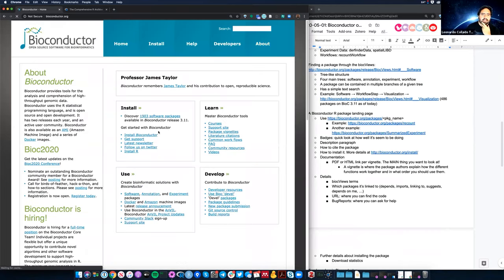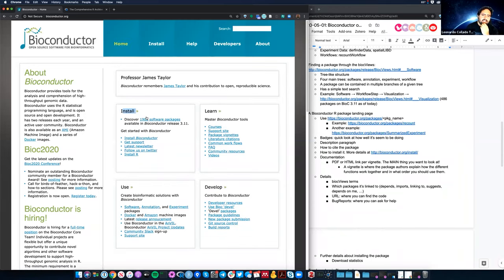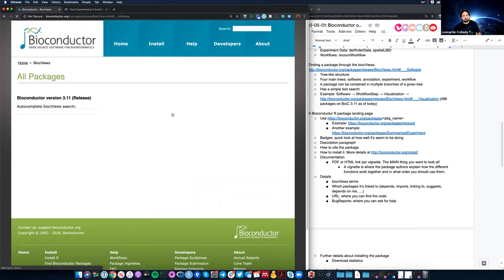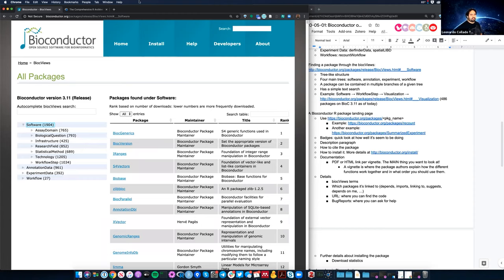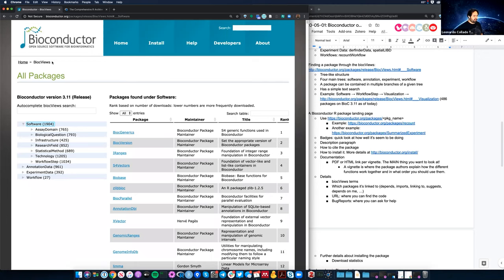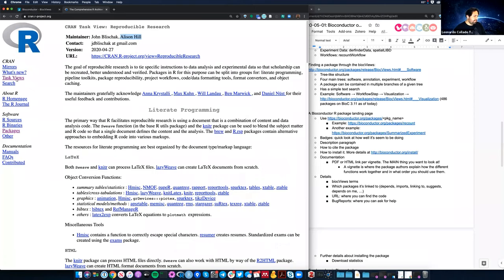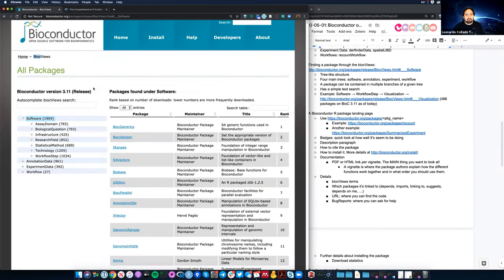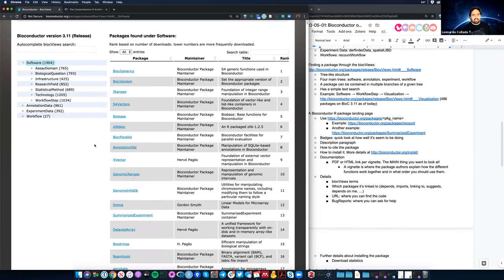On the main landing page there are four little boxes in the middle. One has the install header and says 'Discover 1,900 software packages.' If I click on that, it opens what's called BiocViews. The name is kind of a play on CRAN views — CRAN has task views, Bioconductor has BiocViews. It's born from the same idea of having categories or labels for packages.